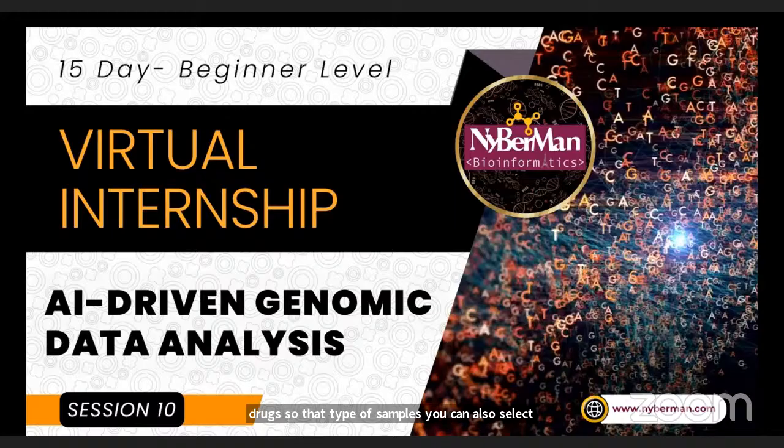So that will work. But you need to check carefully how many samples you have. At least you need to have 5 to 8 samples. 5 is also fine, but try to select as many samples as possible. But since this is a mini project, go with less than 10 samples, with 10 as the maximum for each condition. I will mention this also in the instruction file, so that there will be no confusion afterwards about what type of data set you need to select.